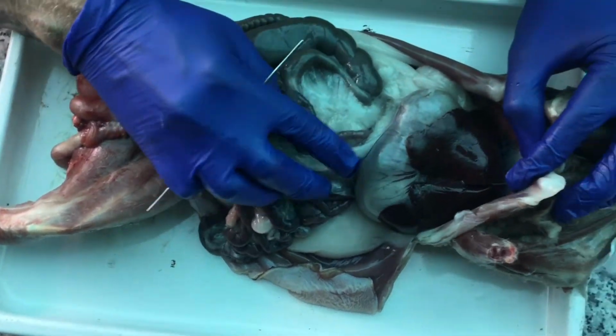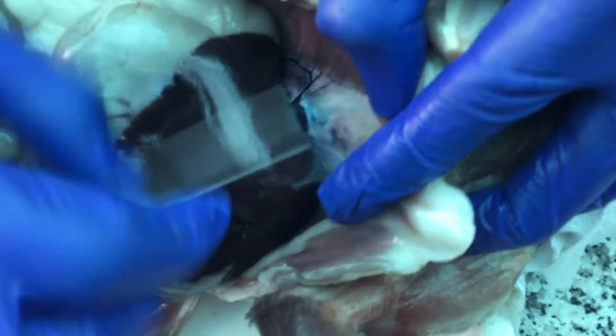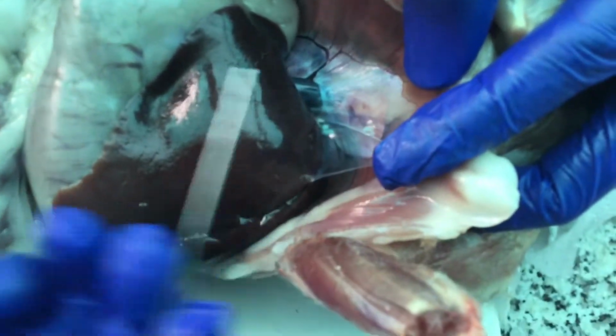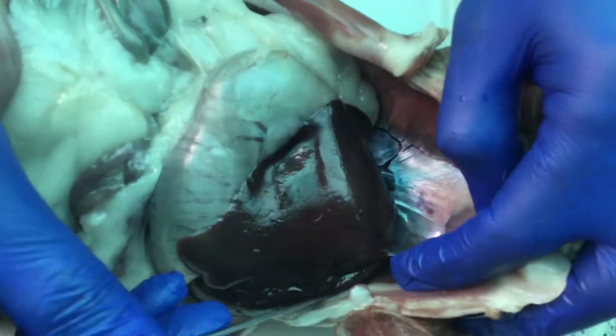And then if we look at the cranial end, and if we zoom in right in here, we're looking on the inferior surface of the diaphragm. See the muscle of the diaphragm? And when that muscle contracts, when that muscle pulls inferiorly, that's what brings air through the trachea down into the lungs. And you can see it connects all the way around the outside of the ribs.